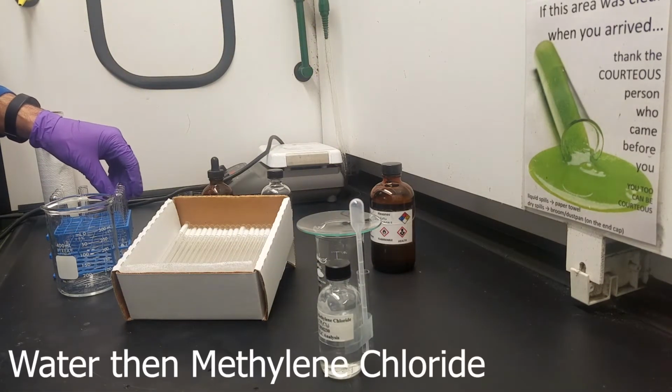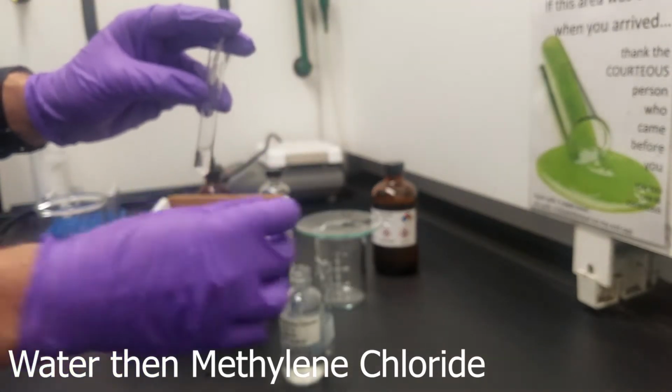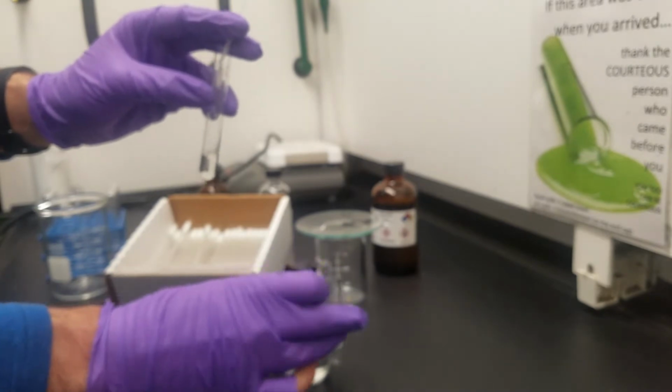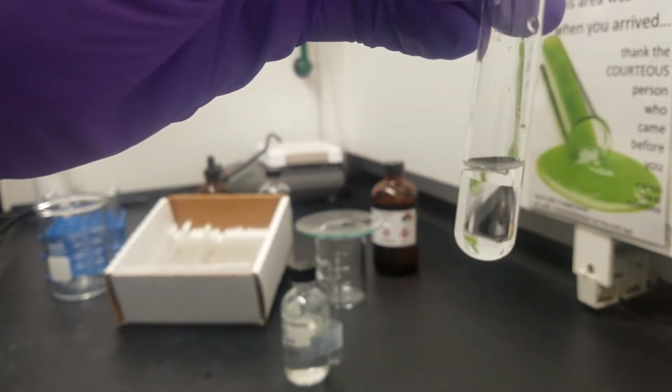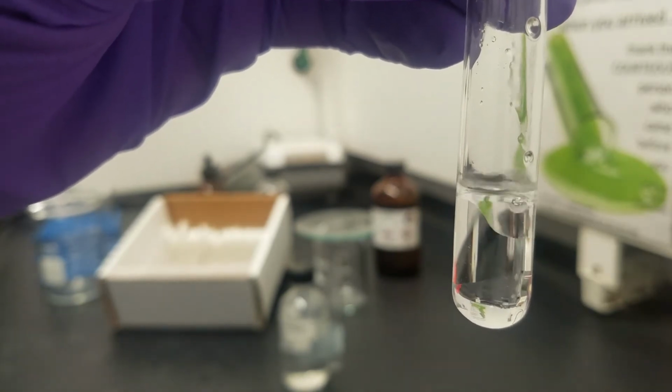This next one is doing the same kind of addition that we ran last time, water, then an organic, so aqueous, then an organic phase. So same sequencing of the materials, what kind of result do we get? Note there's a little bit of drippage that happened from our pipette already.